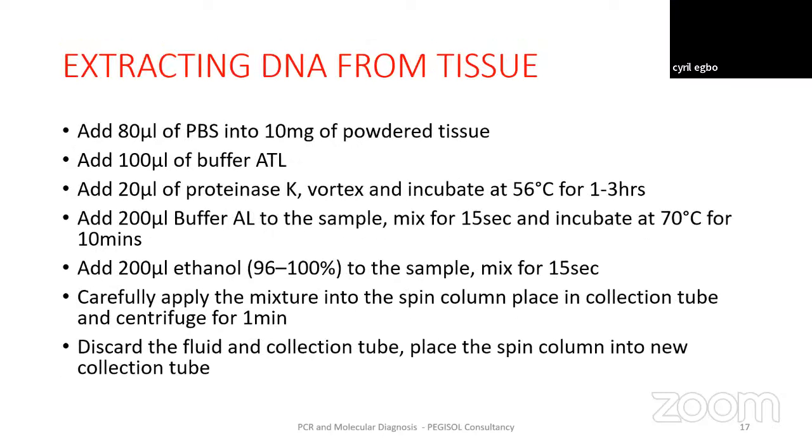So the same procedure is actually used for extracting DNA from tissue, bony tissue, or any other thing, as the case may be. You can extract DNA from hair, from any part of the body. So what you need to do, for instance, if you are using tissue, if it is a bony tissue, the first thing is you need to decalcify. But if it is not a bony tissue, what you need to do is to pound this tissue, at least to break it into bits.